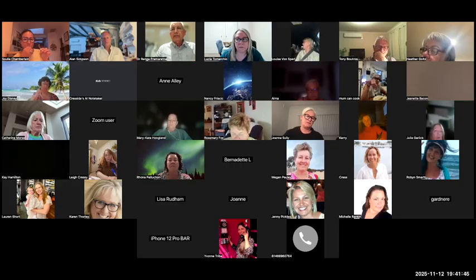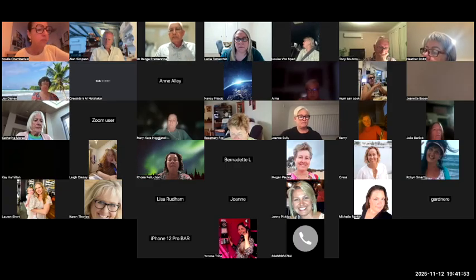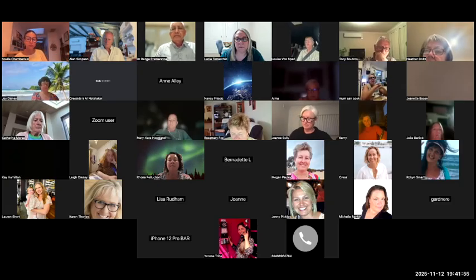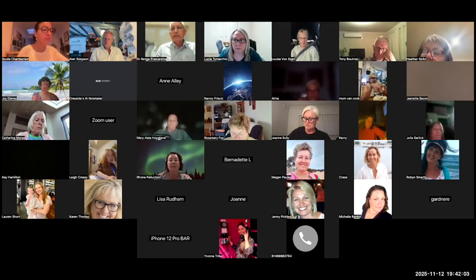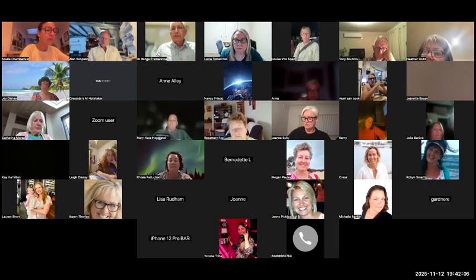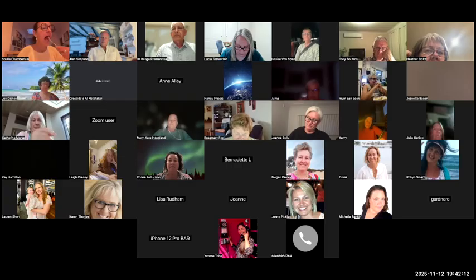So keeping the blood in good condition is very important, and that's the use of dark field microscopy. We can screen within 10 minutes what kind of blood it is. Can we change it within 10 minutes? You can change it, but then you have to change your lifestyle, the causes that brought that oxidative stress. So you need to do a detoxification or maintenance to maintain your red cell health, blood health.